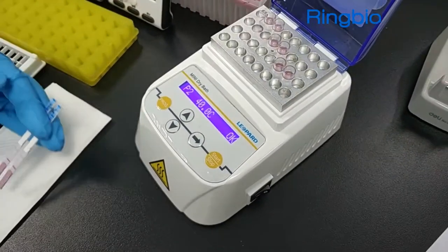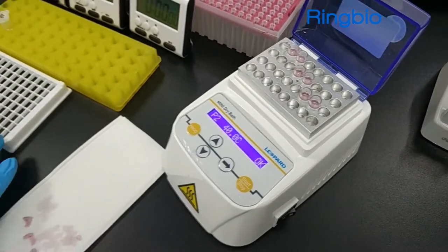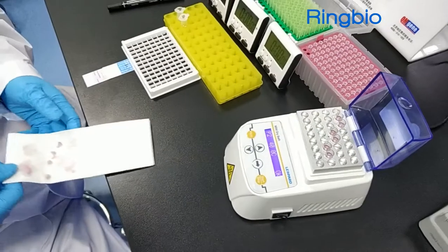After all six tests, remove the sample pad on all test strips and then attach the test strips on piece of paper for record and future traceback.